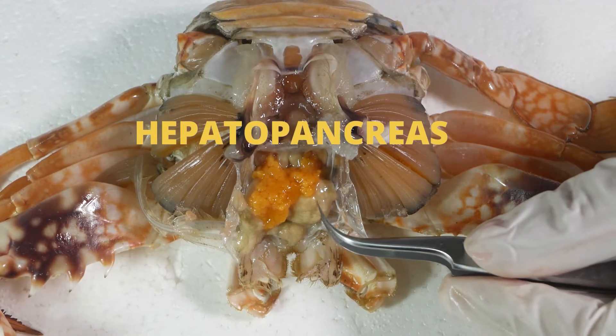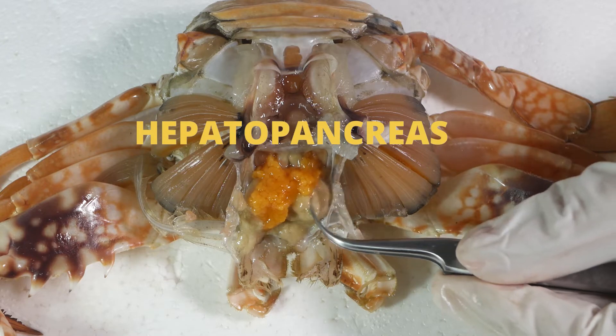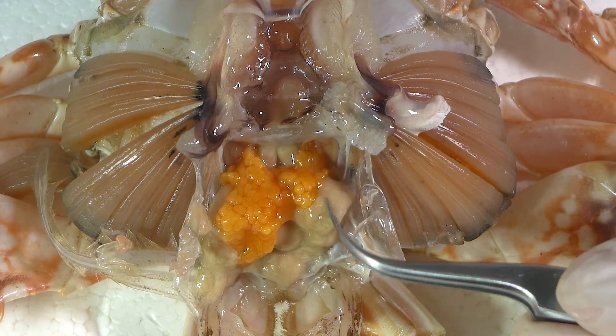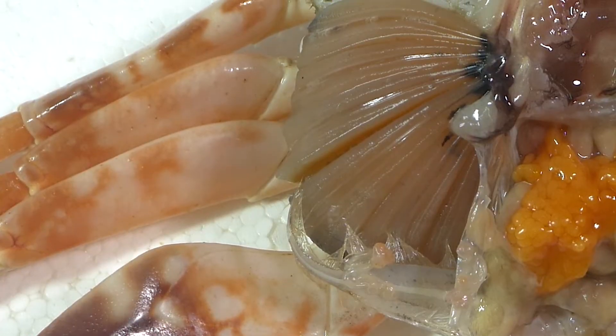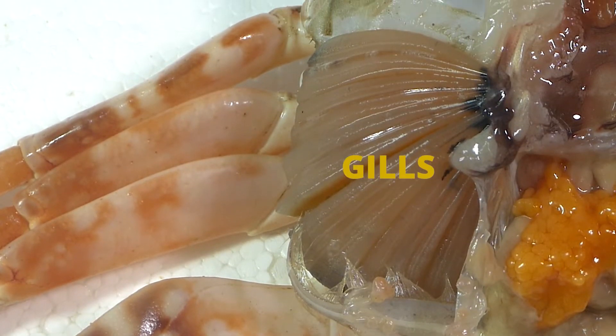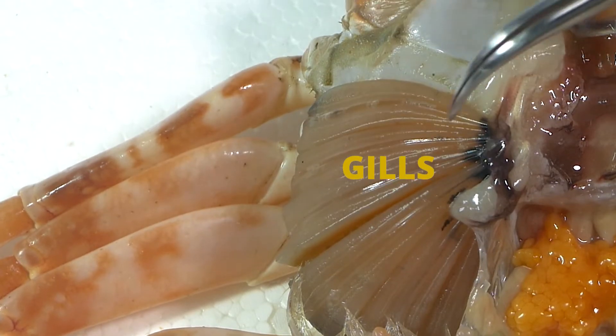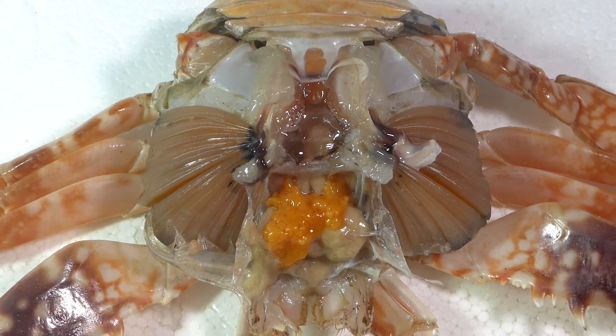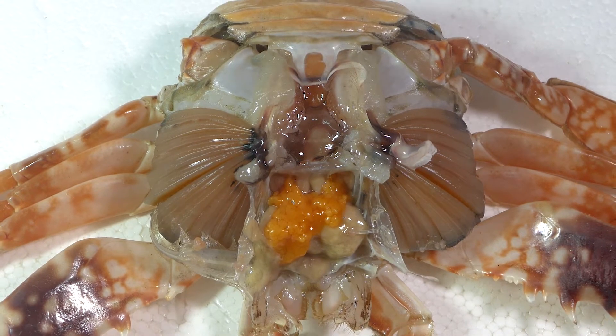The hepatopancreas is a large orange-yellow organ in which some of the above organs are embedded. Next are the gills, with a thin layer of tissue that covers them.